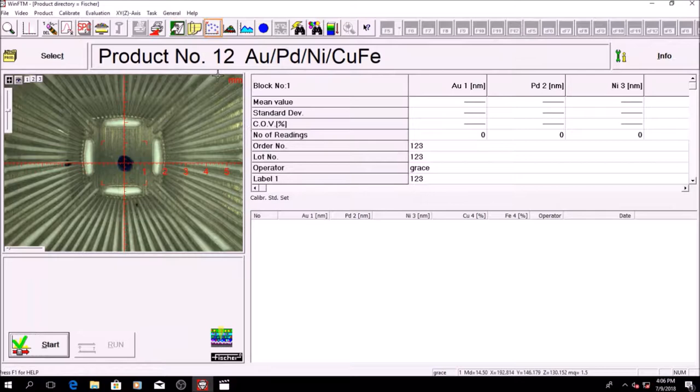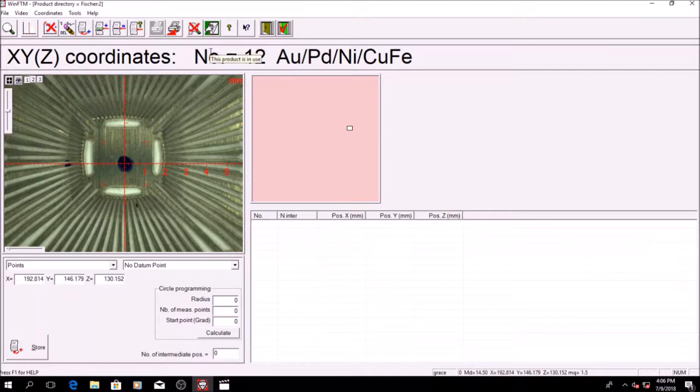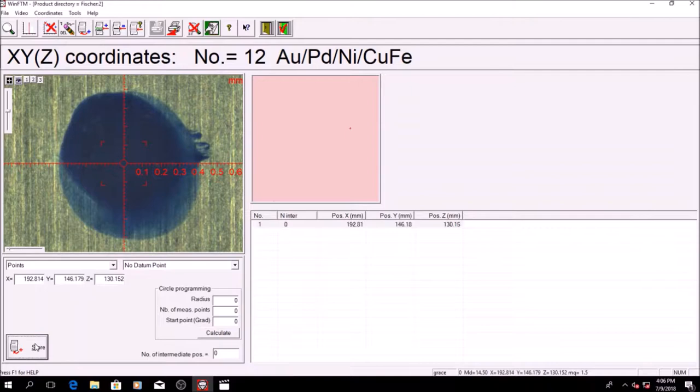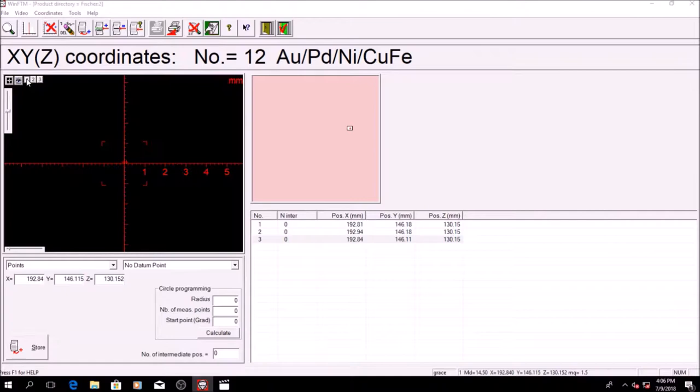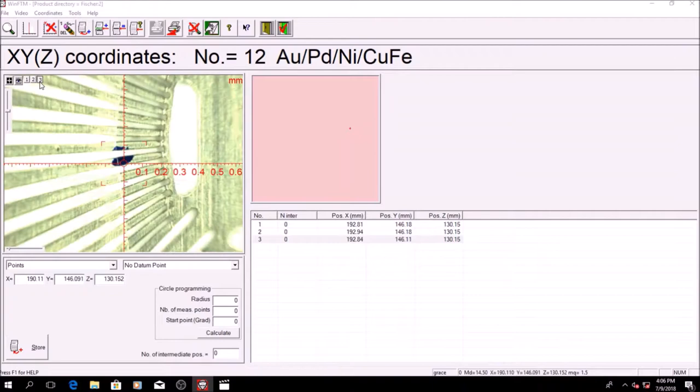Click on XY programming. The default setting is points. Change the zoom factor from 1 to 3 and store the points you would like to measure. In this case, I would like to measure 3 points on the lead frame pad and 3 points on the lead frame lead. Once complete, click save and exit.